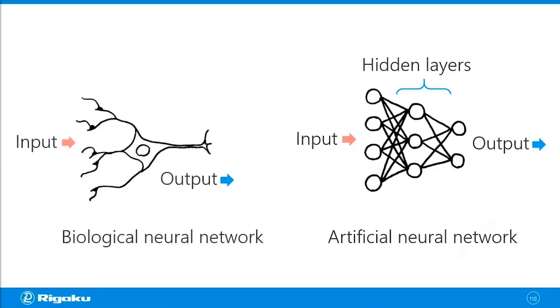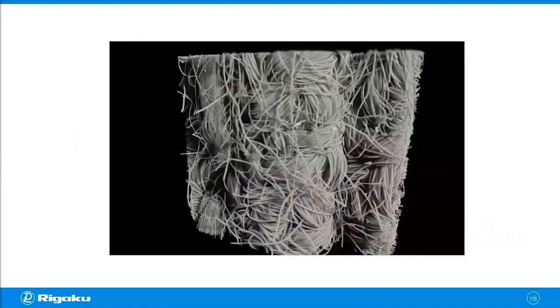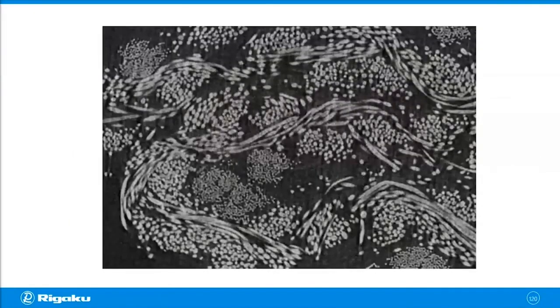And I want to show you an example of image segmentation. This is a CT scan done on a piece of fabric. If you look at this closely, you see thick fibers coming from the main fabric, and also thin fibers coming from the threads going through this fabric. Even with our eyes, we can barely tell the difference between the two. If you look at its cross-section, it's a little bit more clear. Those are main fabric, and this is one of the threads.